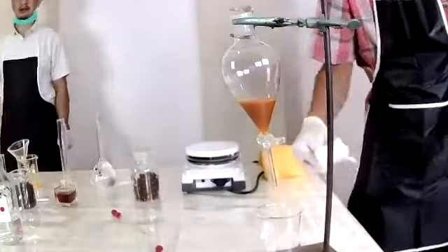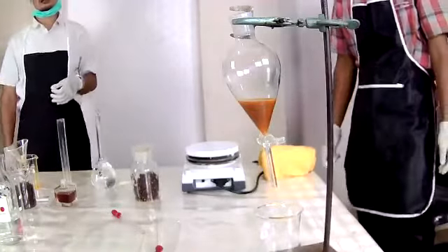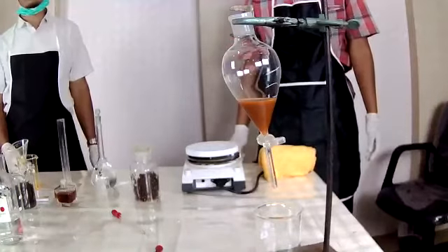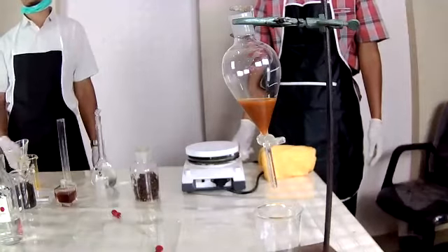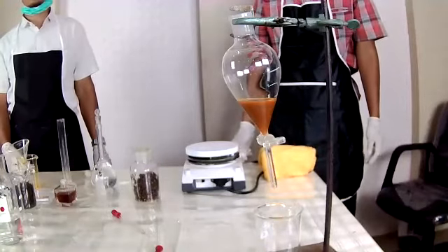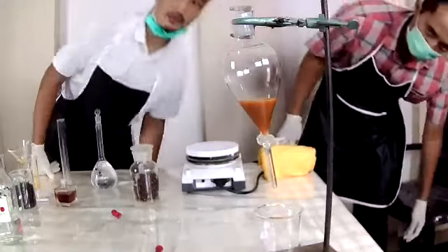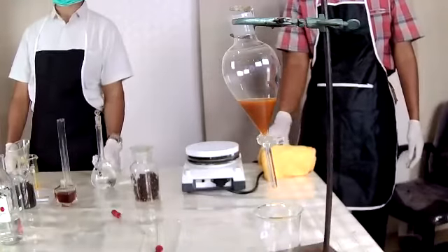And it looks like it's homogeneous now, but we can wait for a few minutes, and the extraction process will continue. It takes a few minutes.